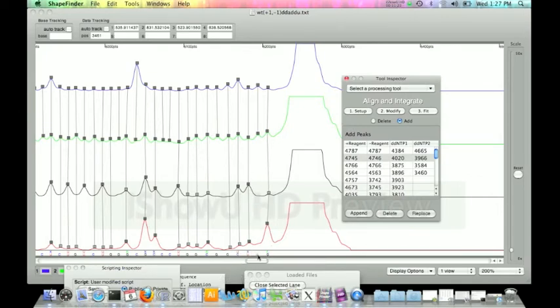And right now I see these two U's here, but I see these two U peaks. So this is actually shifted over too much. So depending on which end of the data you're working on and where you add your peaks, it can shift the sequence a certain direction. So since we've already added all the peaks to the left, I'm going to drop a peak in here, and it's going to shift everything to the left.